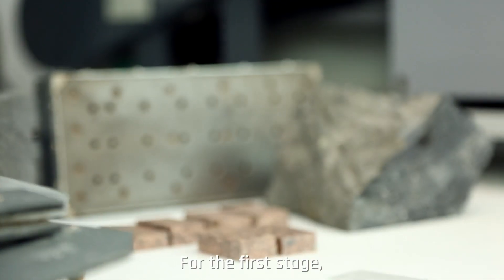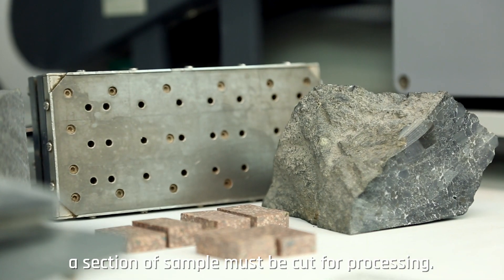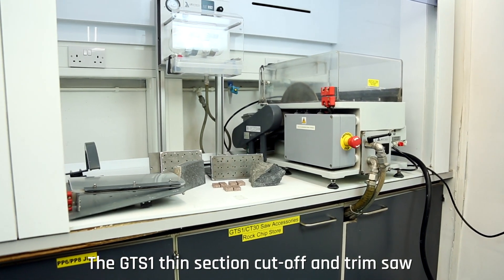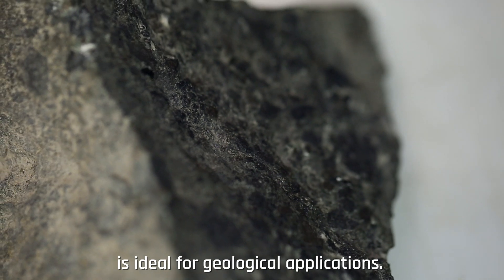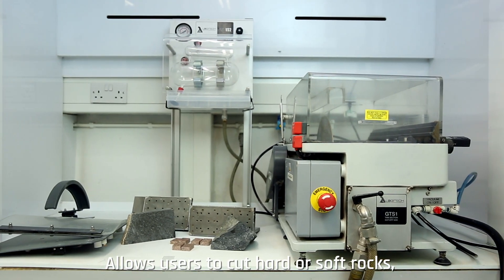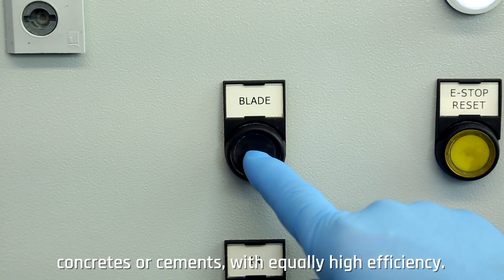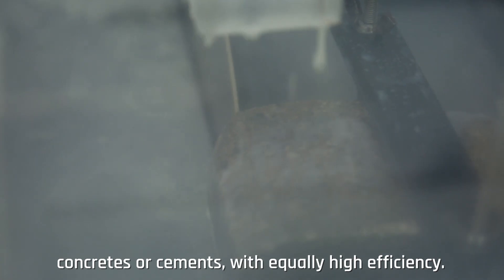For the first stage, a section of sample must be cut for processing. The GTS-1 thin section cutoff and trim saw is ideal for geological applications, allows users to cut hard or soft rocks, concretes or cements with equally high efficiency.